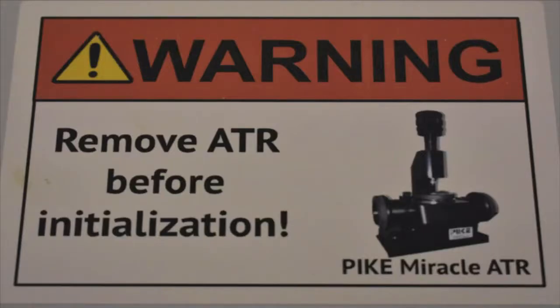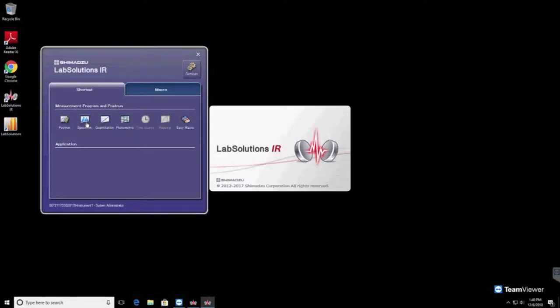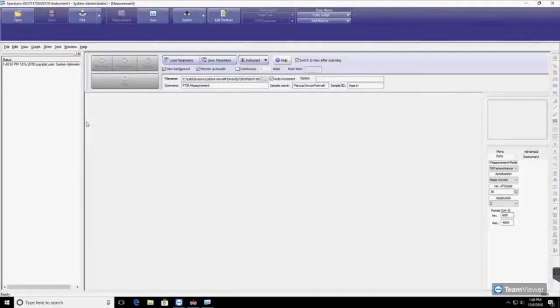Next we're going to do a sample scan. Be sure to remove the ATR. Locate and open the Spectrum program located on the desktop. Under the Instrument tab, select Initialize. You may receive an error message — click Yes to continue.